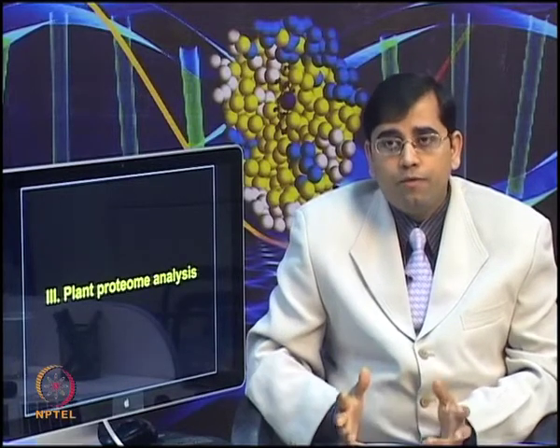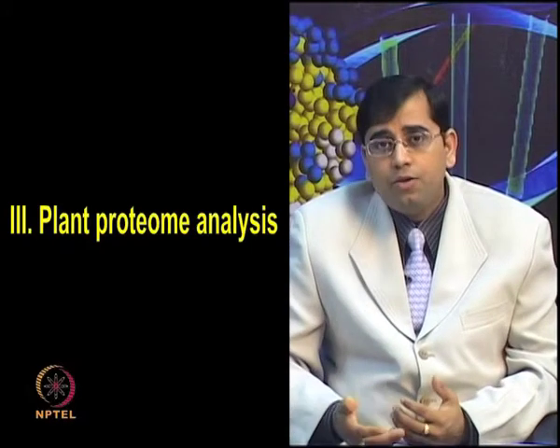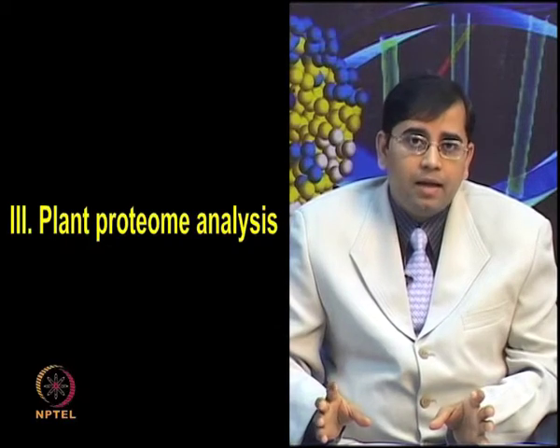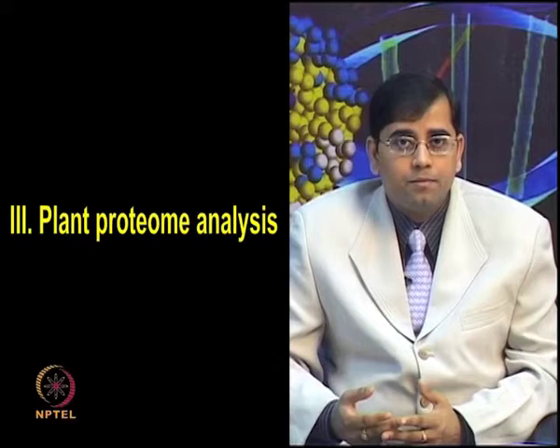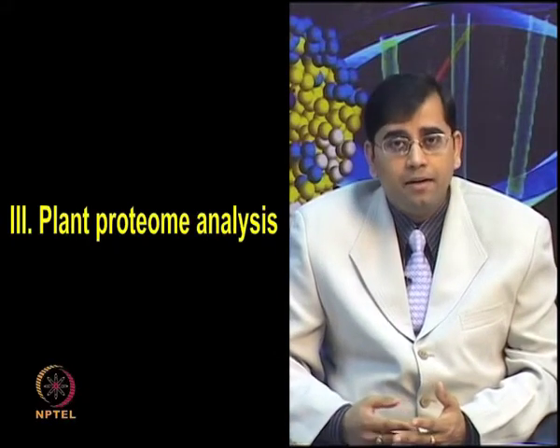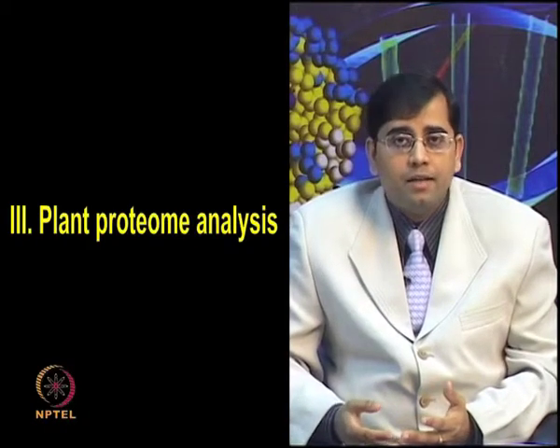So, in the flow of the sample preparation strategies, I tried to give you a feel of different types of samples available and the challenges which are associated with each sample type. We talked about human serum, we talked about bacteria, and now let us talk about plant leaf, how to analyze the plant proteome.